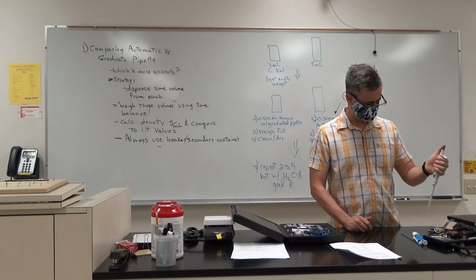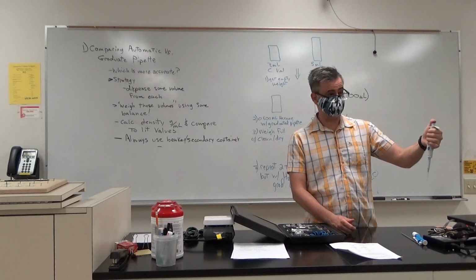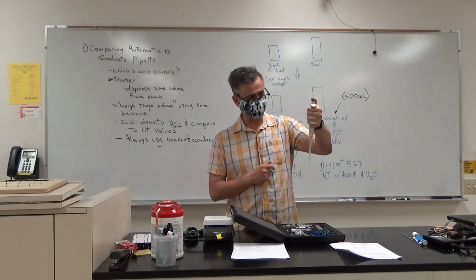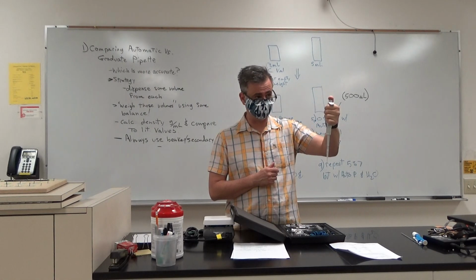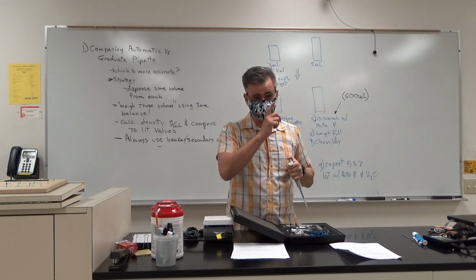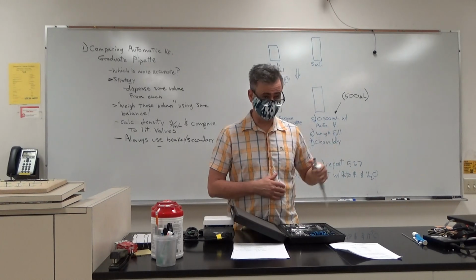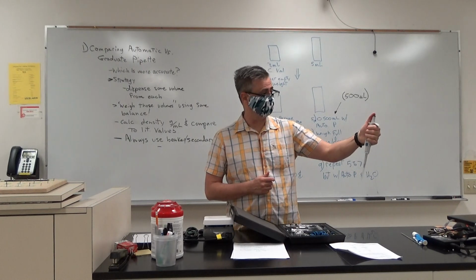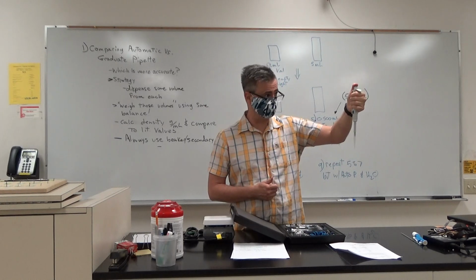Now the way you use it is you depress this. There are two stopping points on a pipette. You press it down and you feel resistance. If I now use force, I can push it down even farther. We don't do the second thing till the end, when we're dispensing. So when we're sucking up, for lack of a nicer way to put it, we only go to that first stopping point.